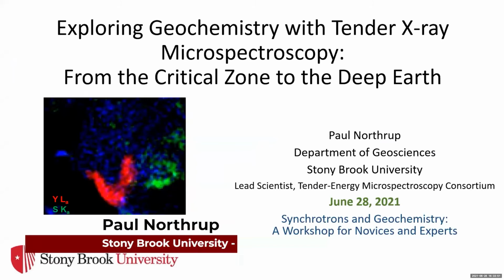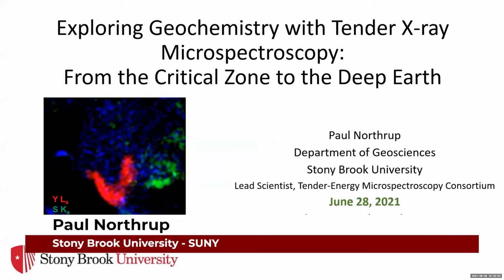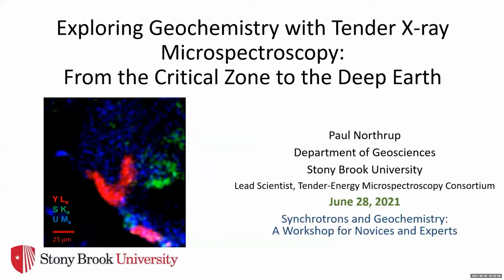So I'm going to present more of an overview of some tools, some familiar tools in an unfamiliar energy range for many of you. I want to introduce the Tender Energy Range and some examples of using the tender energies for explorations of geochemistry.